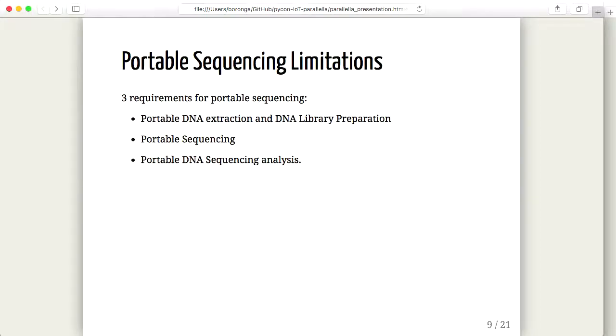The limitations on portable sequencing are that Oxford Nanopore remind me a bit of Steve Jobs, their CEO. They come out with a new chemistry and say this is the next big thing, even if it's just like OS X 10.8 to 10.9, and you think, what are you talking about? Their designs as well, I think they're trying to be the next Apple. Particularly when they were pitching to the vendors, it was basically that you'd prick yourself with some blood, put it on a USB stick, and it would do all the analysis for you.